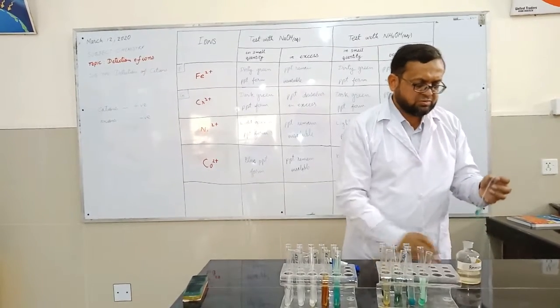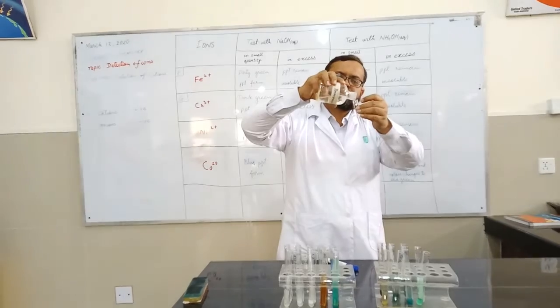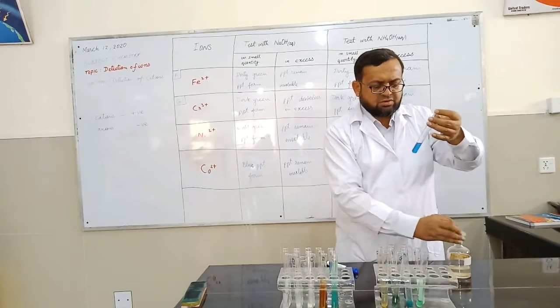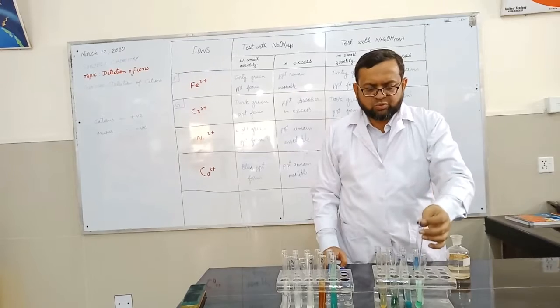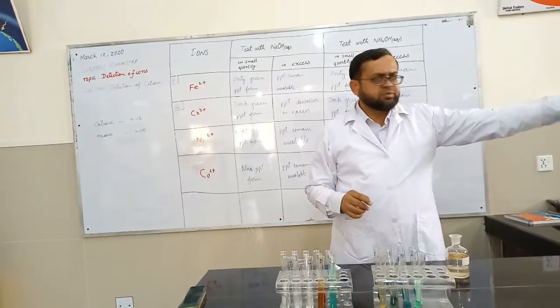And again you can observe, now I am testing ammonia solution or ammonium hydroxide. What is this? It is giving dark blue coloration. I want to share one more thing with you. So I need a test tube.